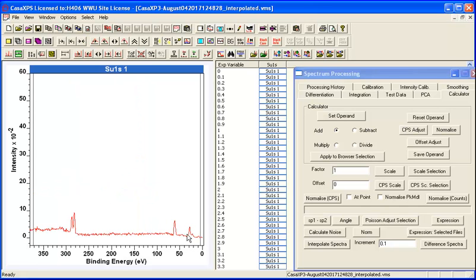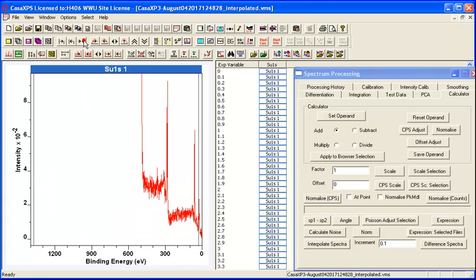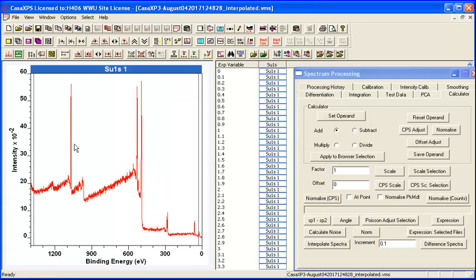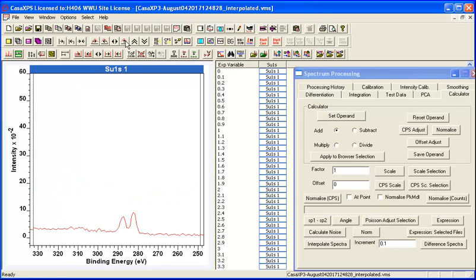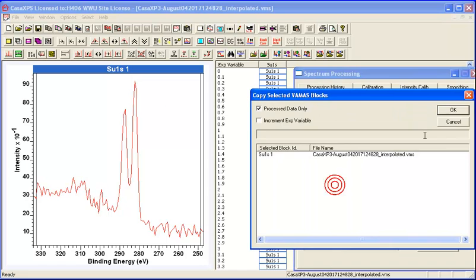And again we've got sodium peaks, some oxygen, so everything is being determined from this different spectrum to have spectral features that look reasonably consistent with what you might expect from a material. But the thing that is really interesting is this structure here. So what I'm going to do is take a copy of that.